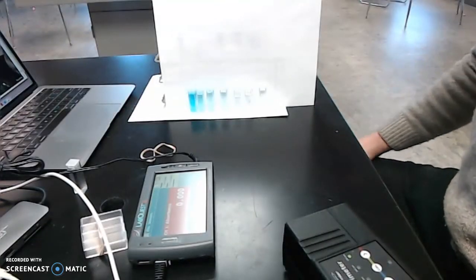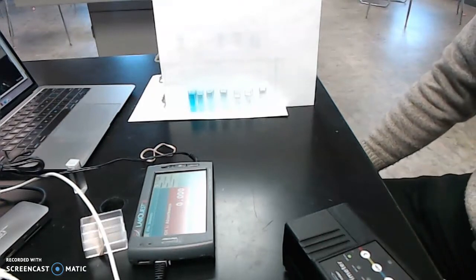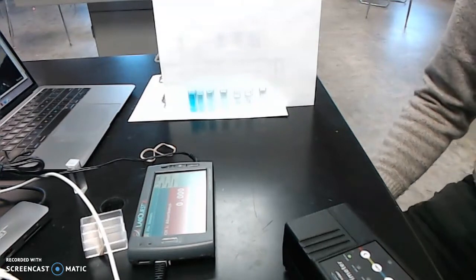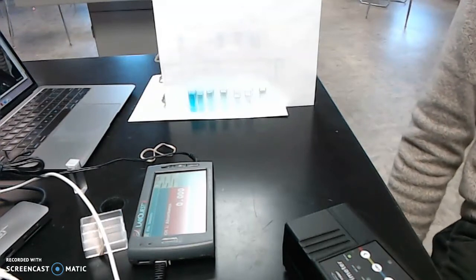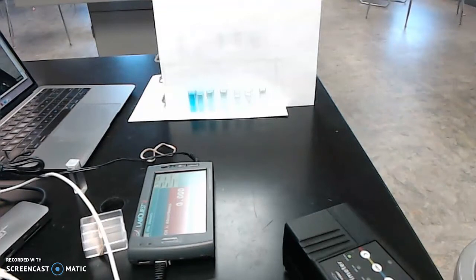All right, we are now going to look at some data for the toxic waste cleanup lab. And I'm going to have to walk over one lab bench and get our piece of 0.052 gram aluminum foil because I need to show you part two at the beginning here.